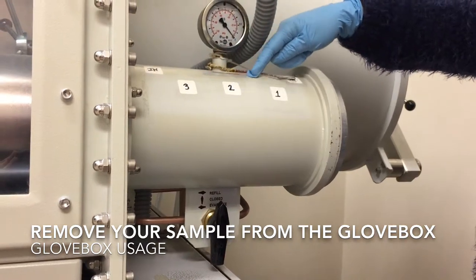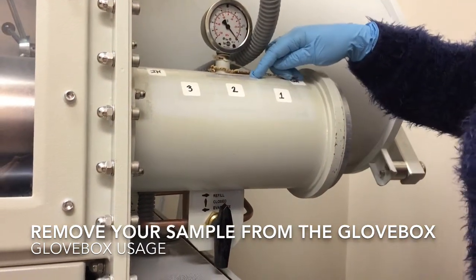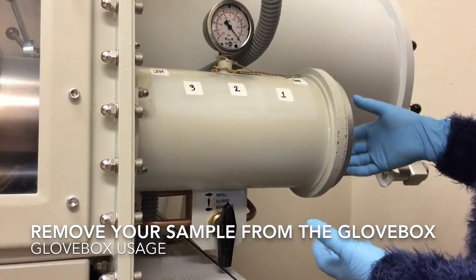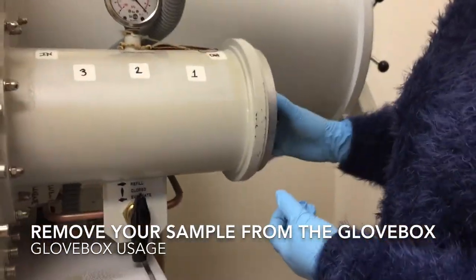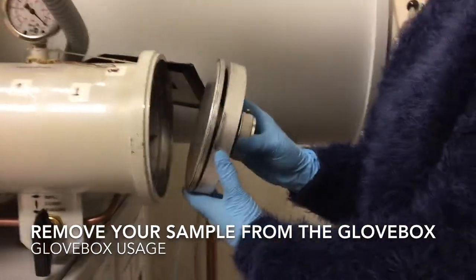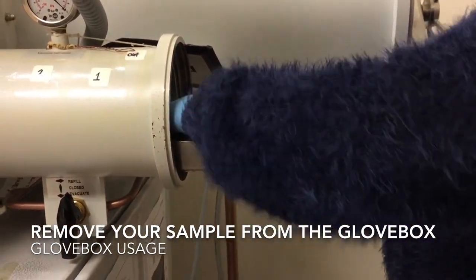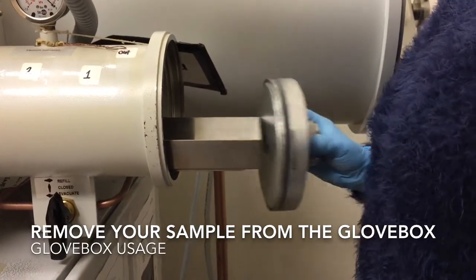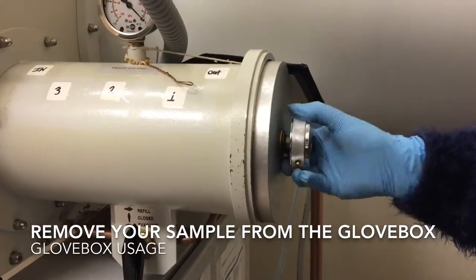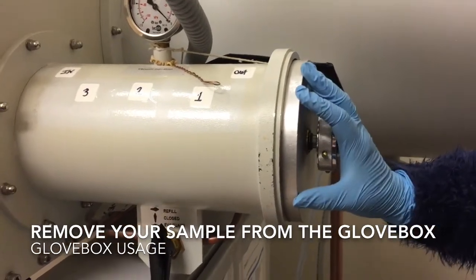I'm going to turn this indicator to 'out' so that the next user knows that they have to re-evacuate the anti-chamber. I'm just going to turn the knob the same way that we did to bring it in, remove my sample, and turn the plate and the knob so that the door is closed.